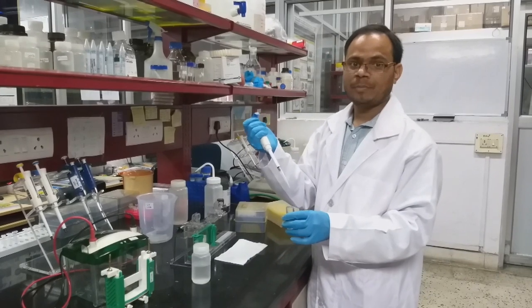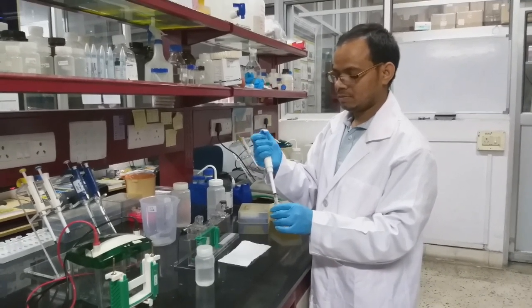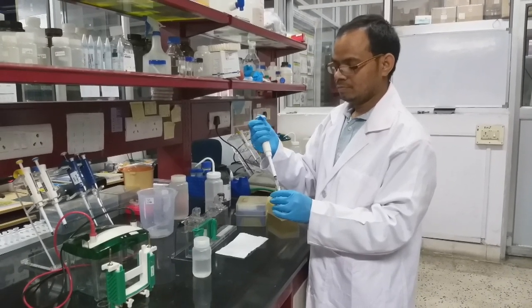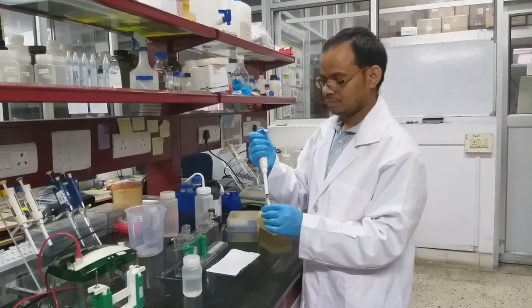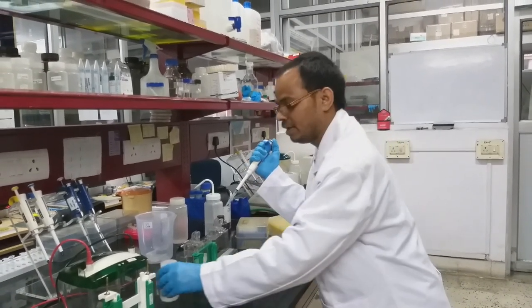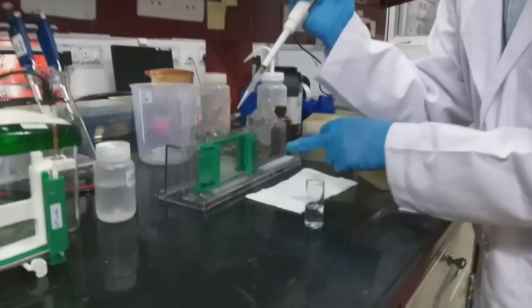We have to mix properly. Then add slowly at one corner.